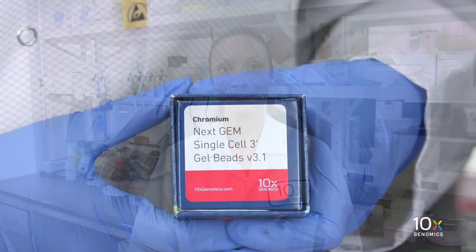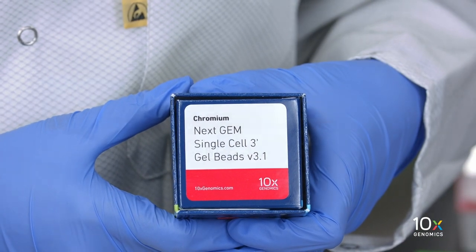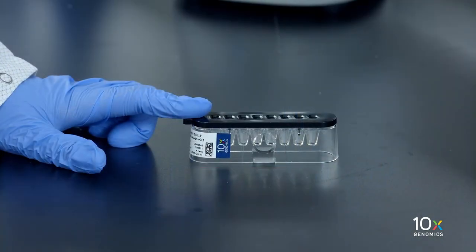We have our single cell suspension on ice and now we're ready to prepare the master mix. In the meantime, we have taken our gel beads from minus 80 degrees Celsius. The gel beads need to equilibrate to room temperature for at least 30 minutes.